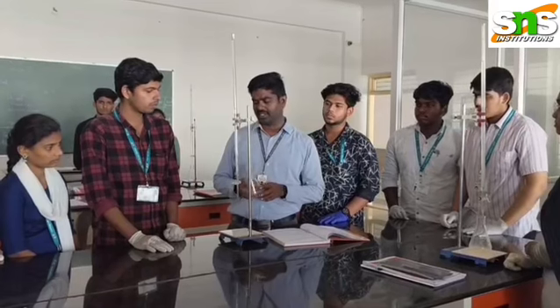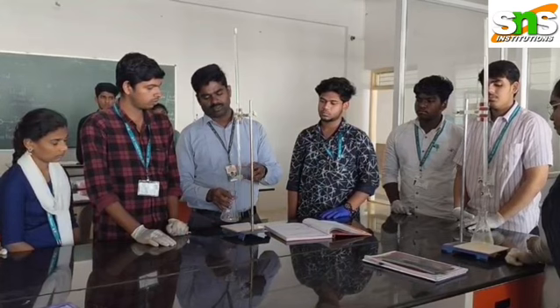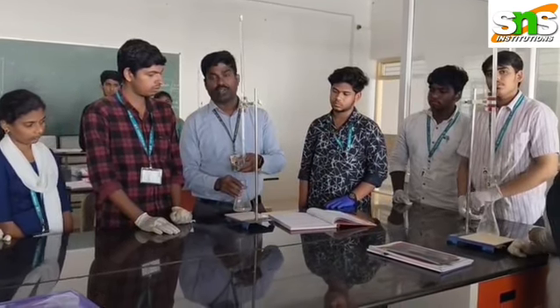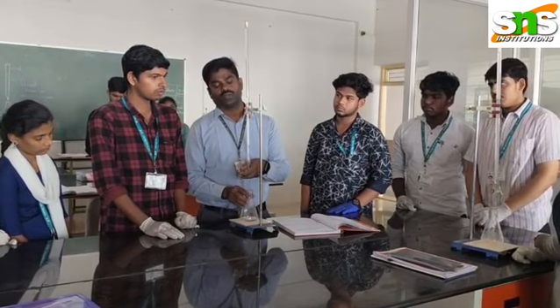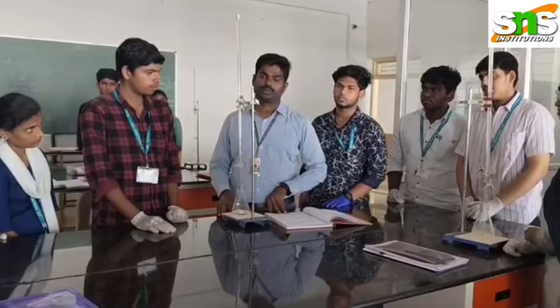So you will start the titration now. This is the right setup for the arrangement of a volumetric titration. In the left hand we hold the burette and in the right hand we hold the conical flask. One of my students is going to continue this titration now.